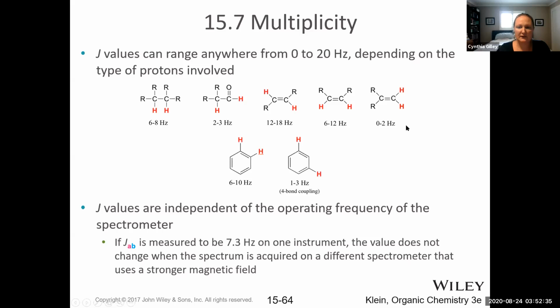They're very, very different. This can be very helpful because sometimes we have alkenes in our structure and they might be cis or trans, or E or Z. It can be very helpful to measure coupling constants. These are clearly protons attached to the alkene carbons because the signals come in the range of 4.5 to 6.5 ppm for chemical shift.